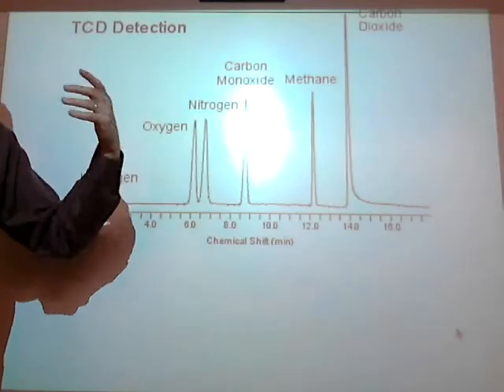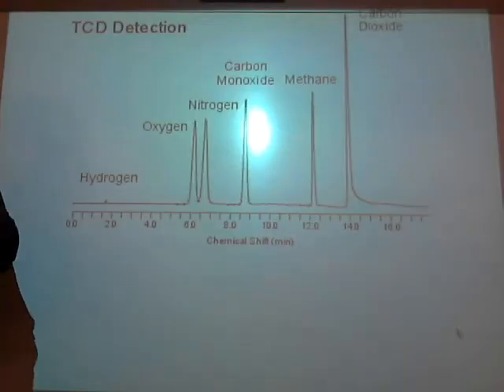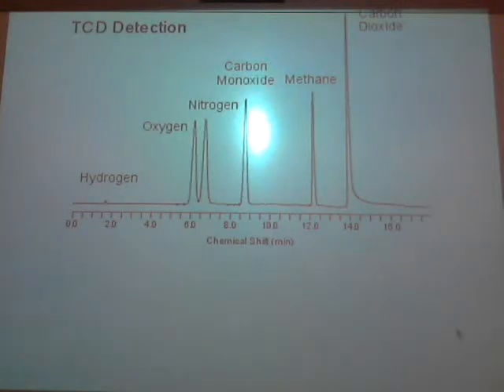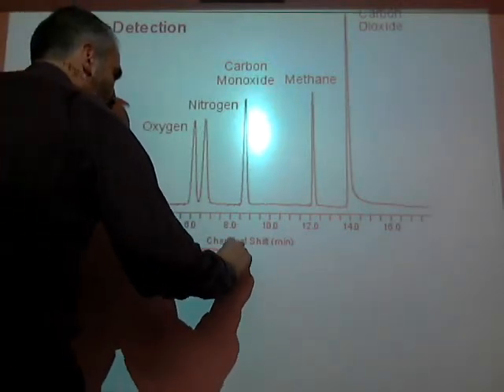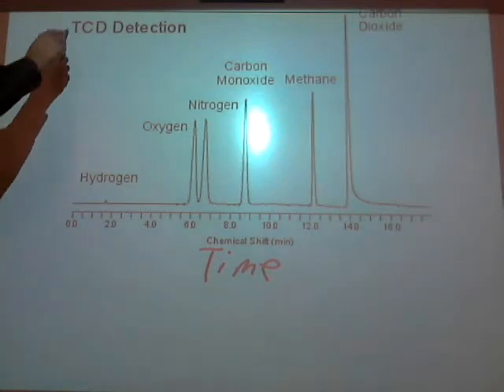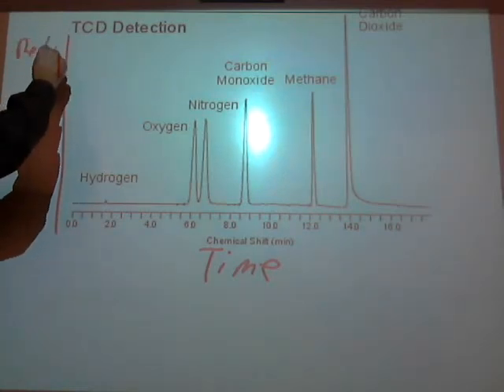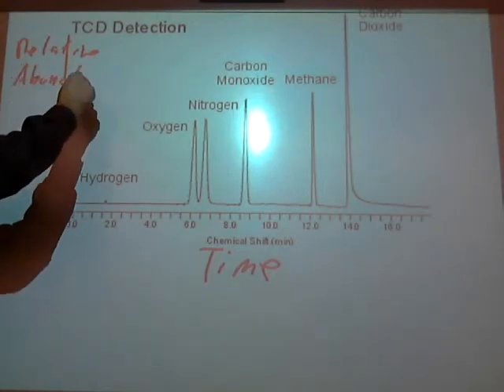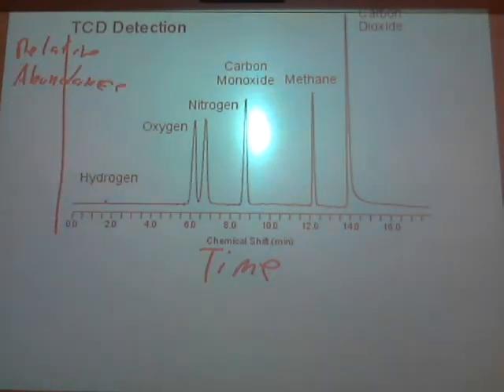Oxygen, nitrogen, all these other components. Which is the largest amount? How much of the percentage of the mixture did you have there? What was the highest? Carbon dioxide. So you can always tell from this chart that the time is always going to be on the x-axis, and the y-axis will always be the relative abundance. In other words, I could tell how much of that sample was carbon dioxide versus methane versus carbon monoxide.